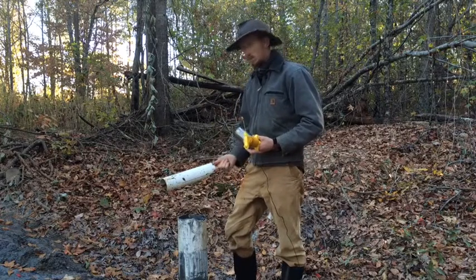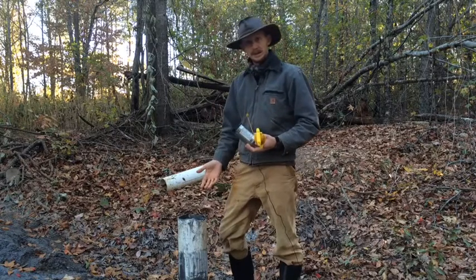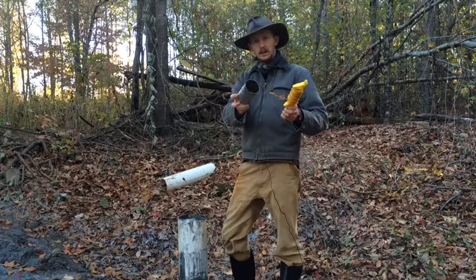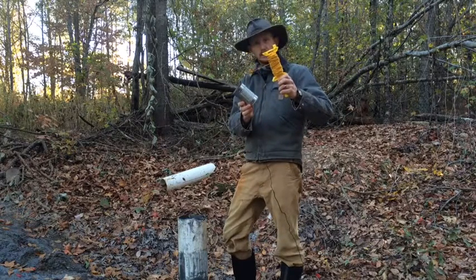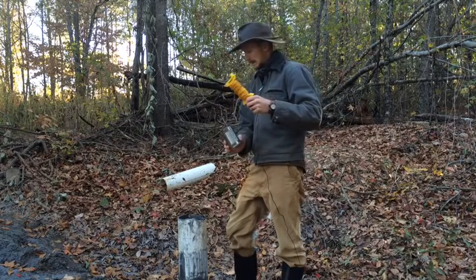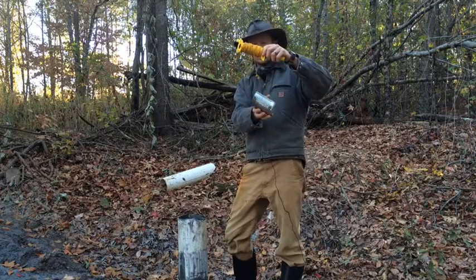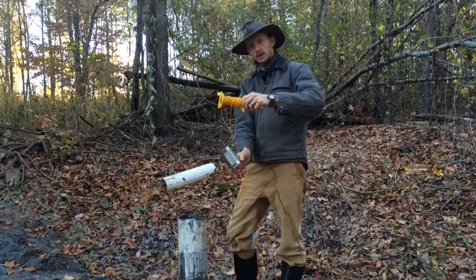So trying to get a water sample out of here when there's no pump — the issue is how to get it out. What we have today is a tin can that I put some wire on and connected to this string here on this reel. Because of this pipe here, if we drop it straight down, the can might have a tendency to float. So I've put the wire at an angle so that the can will go in on the side and collect some water that way.